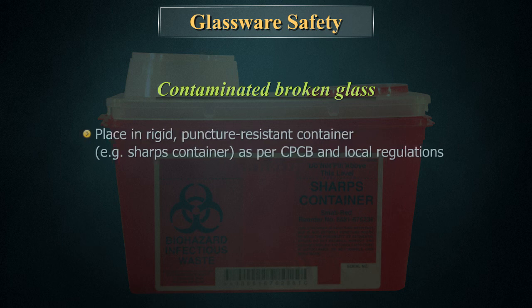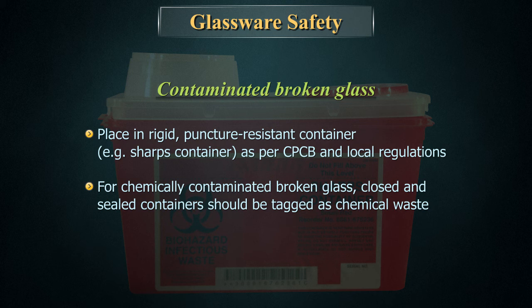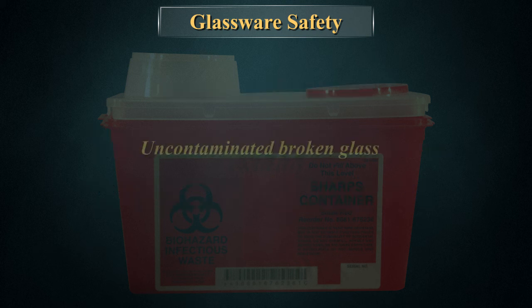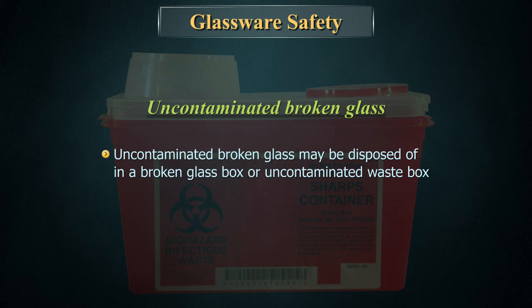Contaminated broken glass should be placed in a rigid puncture-resistant container, such as a sharps container, as per CPCB and local regulations. Chemically contaminated broken glass should be placed in closed and sealed containers tagged as chemical waste. Uncontaminated broken glass may be disposed of in a broken glass box or uncontaminated waste box.